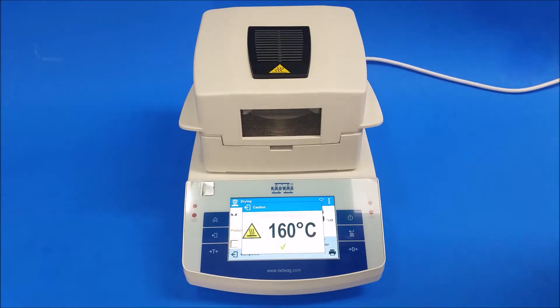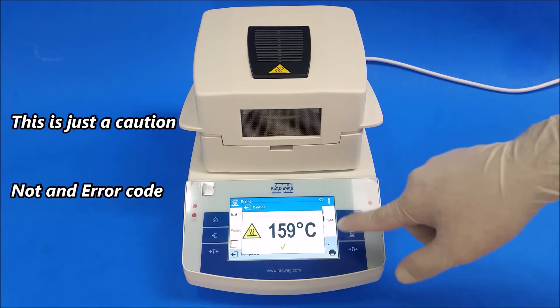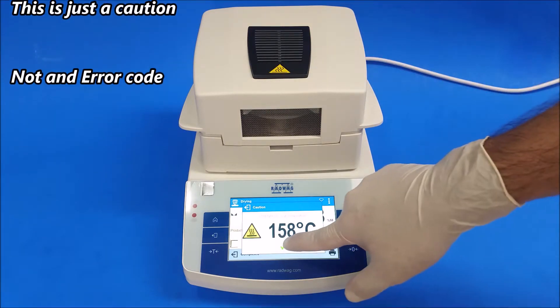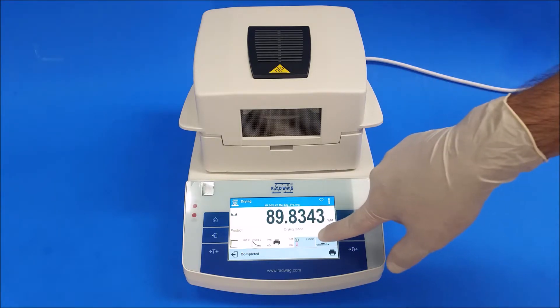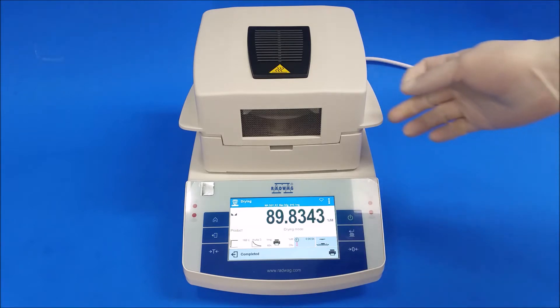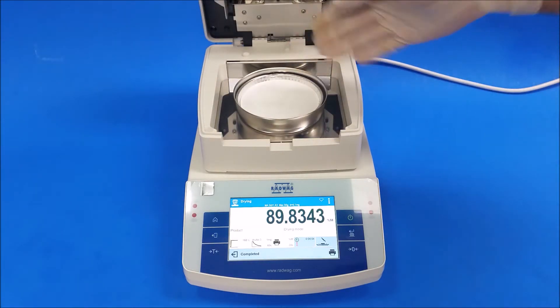Once it ends, it's going to give you an attention high temperature warning — nothing bad, just telling you it's still hot. Hit the check mark and it will give you results: the time and how long it took. Remember, this is hot, so you can just let it cool down.